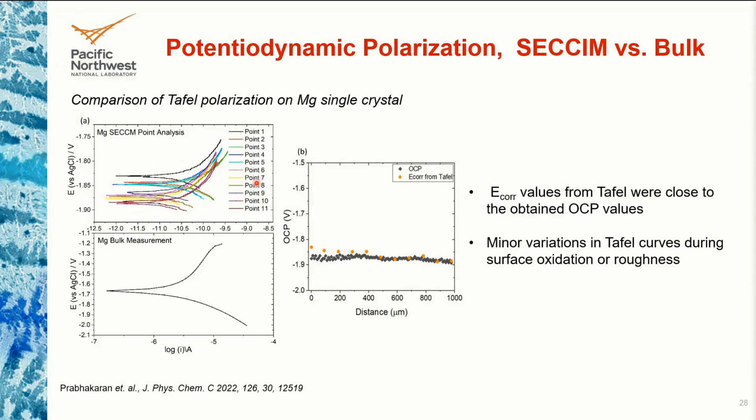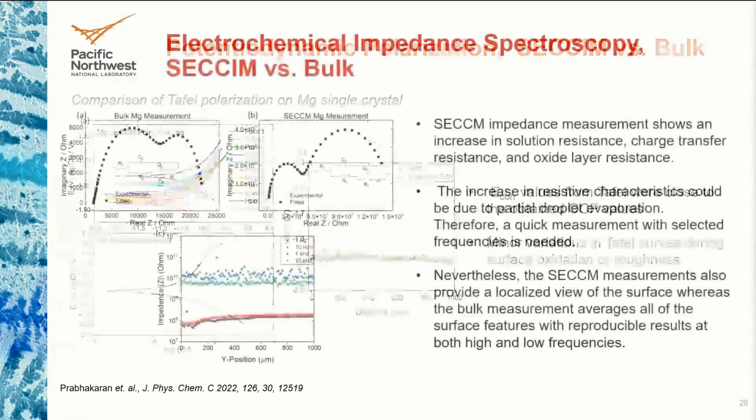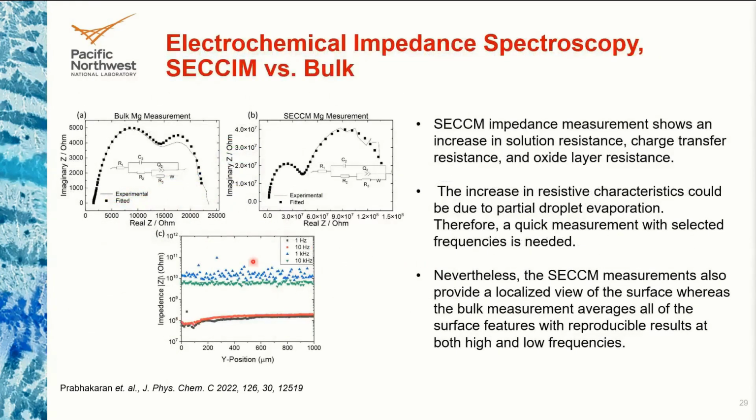But overall, the shape of the curve is very similar to the bulk, and it's been constant over the different points on the surface. So next, the electrochemical impedance spectroscopy, where we did it on a similar curve, wherein it also showed a very similar response.